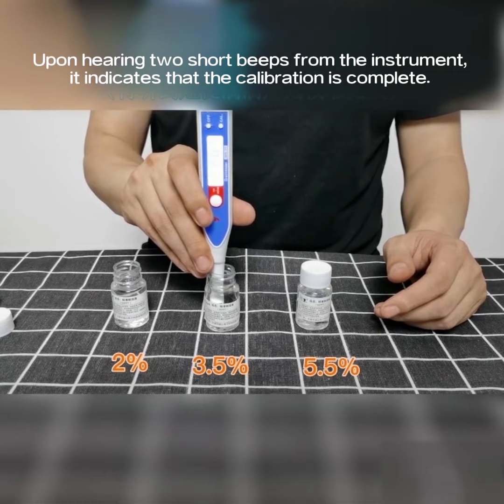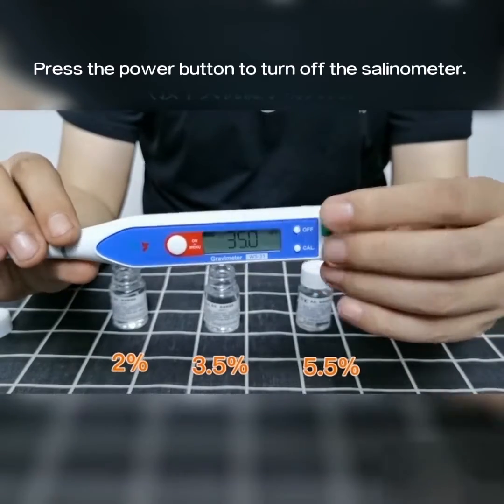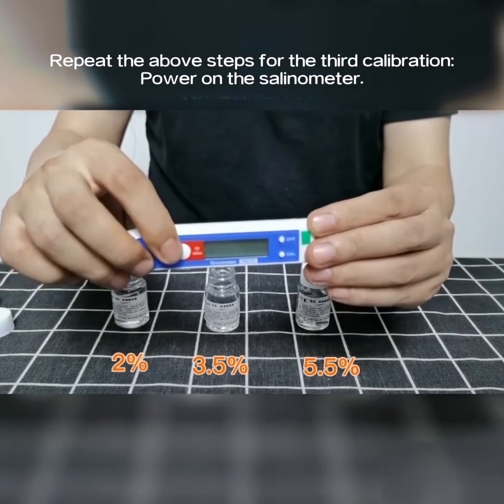Upon hearing two short beeps from the instrument, it indicates that the calibration is complete. Press the power button to turn off the selenometer. Wipe the probe section clean using tissue paper. Repeat the above steps for the third calibration.